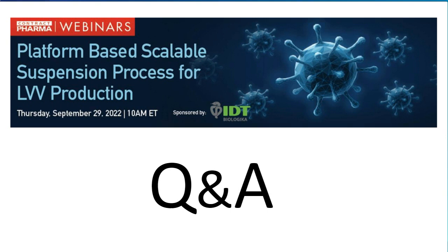Okay, great. Thanks, Ashley. Let's see here. We have a few more. Moving along, this attendee would like to know, are fluidized bed bioreactors like iCELLis bioreactors useful? I think I'm saying that right. Yeah, I can get that one.